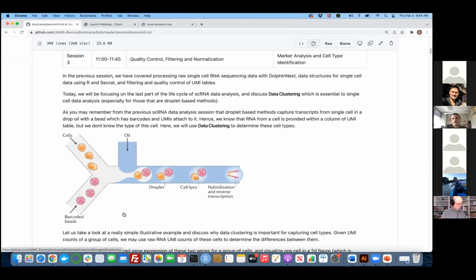Now, that's also a really good way of quality control. Sometimes different cell types might be mixing, for example some blood cells, if you're using samples from some other part of your body that you don't really want represented in your data set. Then you can cluster, see that maybe red blood genes are higher in them, and you can just chop them off because they're all clustered and have a similar expression, and so forth. So basically, the machine learning concept of data clustering, partitioning the data into meaningful subgroups, applies quite nicely to single cell analysis as well.